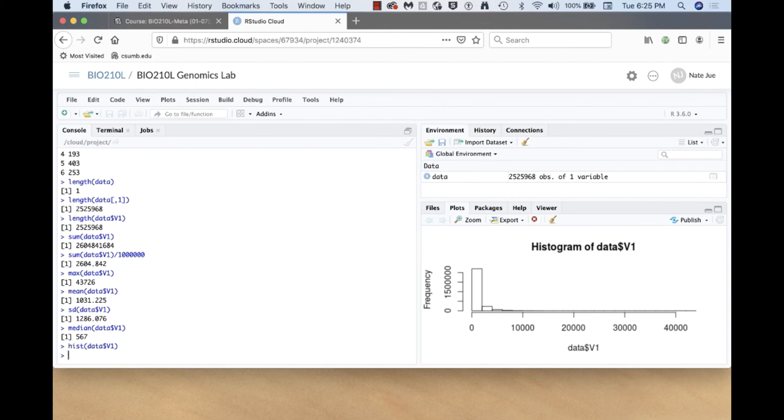You can see it looks like I have a lot of observations. Looking at the frequency of observations over here, the frequency of observations are very high for sequences that are rather small. But you can see it goes all the way up to 40-something thousand because that's my largest sequence, right? So it kind of has this decreasing curve look to it. But this isn't the prettiest graph that I could think of or present.